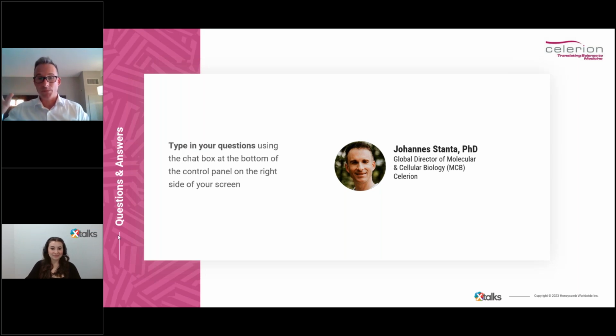Yeah, well, great question, and I totally agree. The context of use of an LBA or LC-MS method is different. It is really to provide quantitative results in the region of 15% or 20% for LBA, to inform usually in bioanalysis about the PK assessment. So that's the main aim. The context of use for the shedding assay is that we're doing a quantitative assay, but it's the qualitative result that has the main impact on the clinical trial.